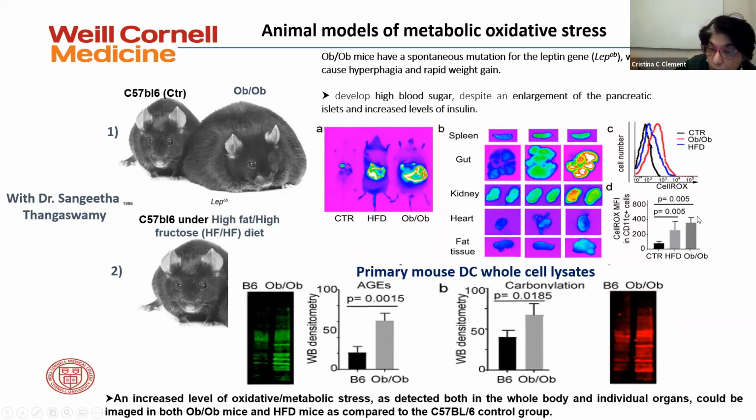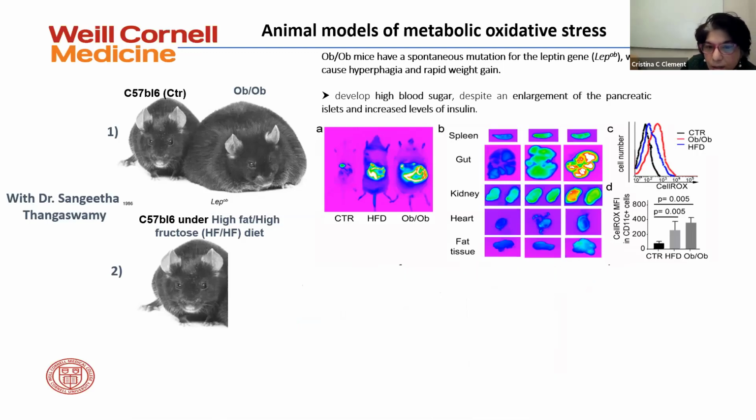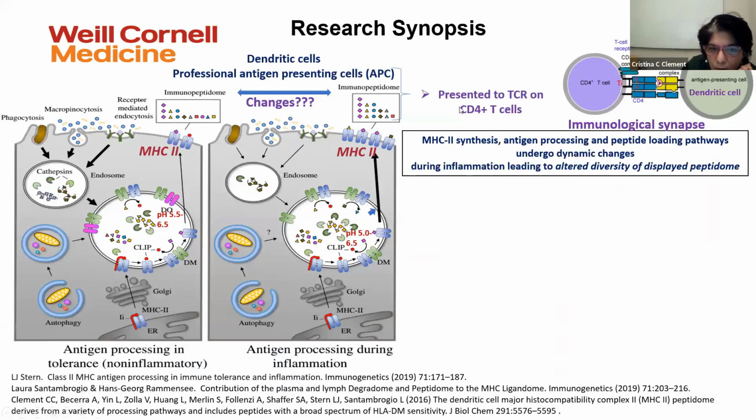But I don't think that we yet have a full analysis on MHC class 2 upregulation, how the PTM affects the MHC class 2 expression. Even in this cartoon, from a review, it is suggested that it's always increased under inflammatory conditions. We know that, but we don't know the total.